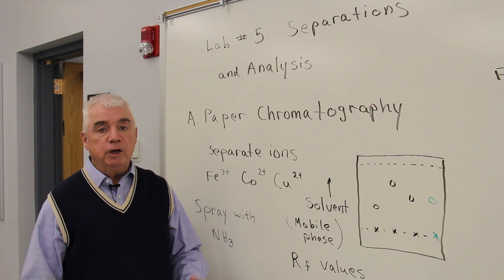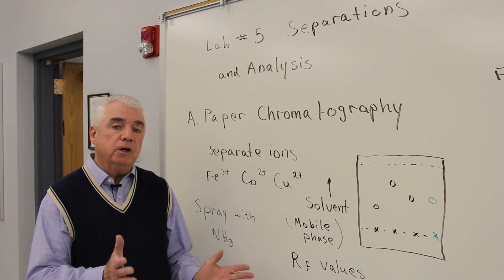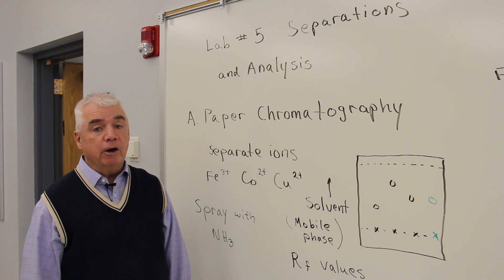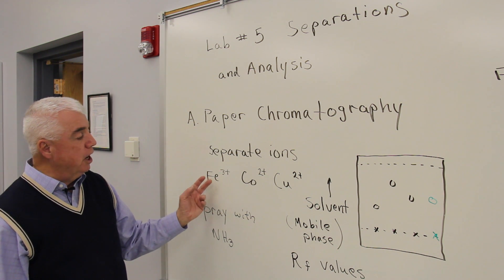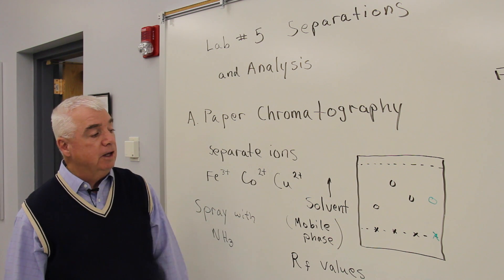Paper that we use in paper chromatography is a little thicker, a little more absorbent than ordinary paper. And in this case, we'll be separating ions: iron, cobalt, and copper ions.